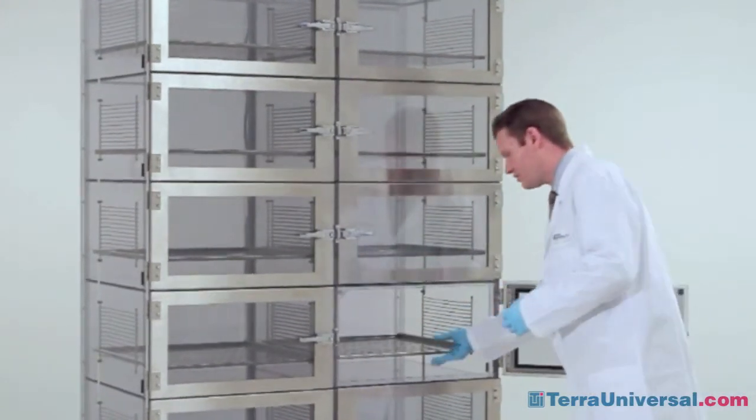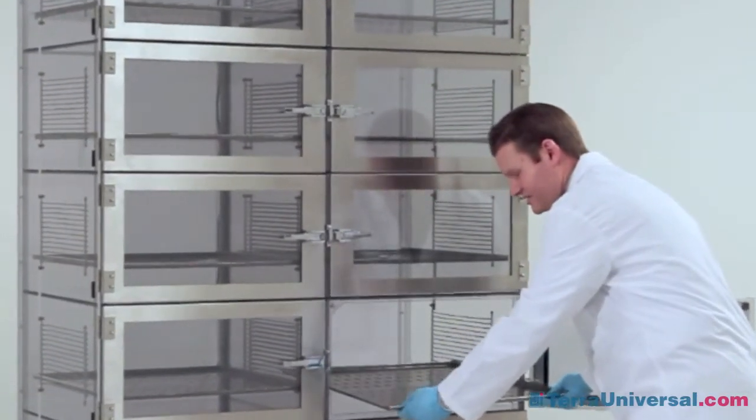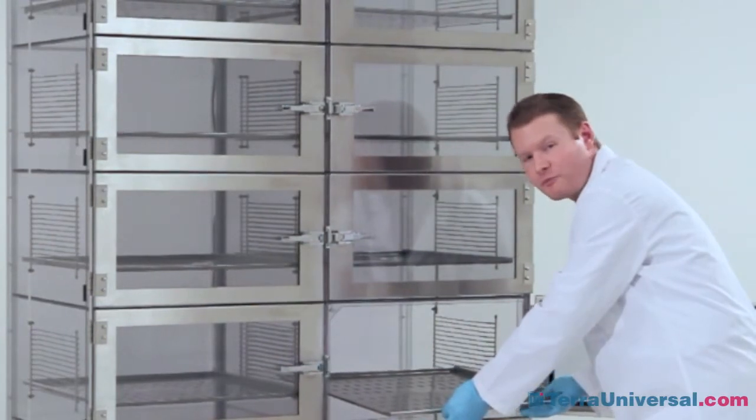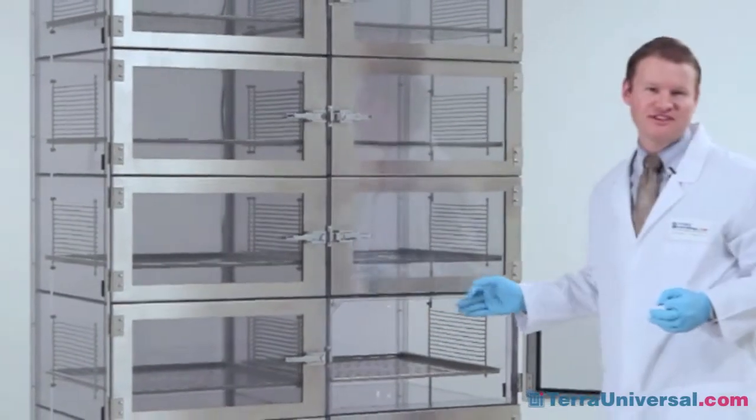Each chamber will include a stainless steel shelf or stainless steel tray that can be made in solid stainless or perforated stainless and mounted within the chamber at seven positions.